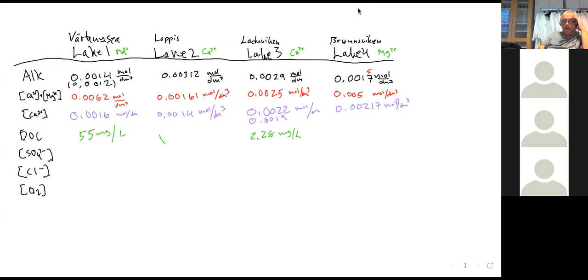We did Lake 2. We did 2 samples at the same time. So we got one that was 71.1153, which we rounded off to 71. Milligrams per dm3, or per liter. And then the second one, if we rounded off, was 68. Those two fit very well to each other.